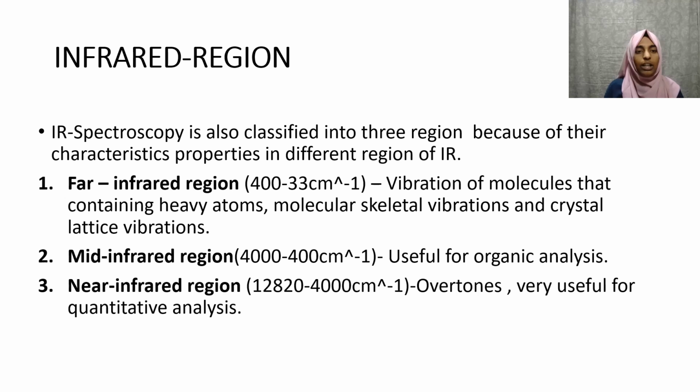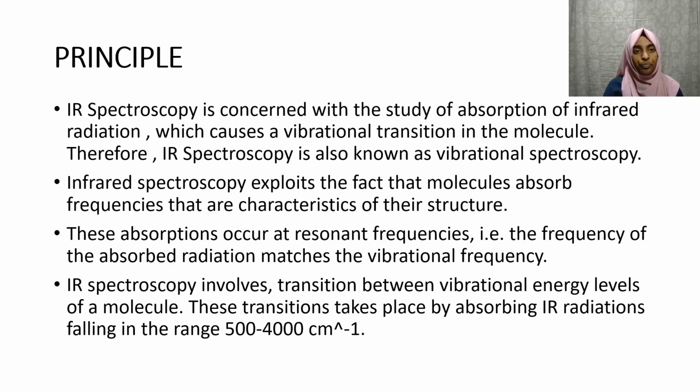The second one is the middle infrared region. Its range is from 4000 to 400 centimeter inverse. It is useful for organic analysis. The third one is the near infrared region. Its range is from 12,820 to 4,000 centimeter inverse. Overtones are very useful for quantitative analysis.